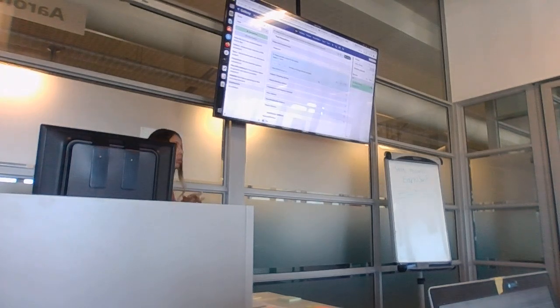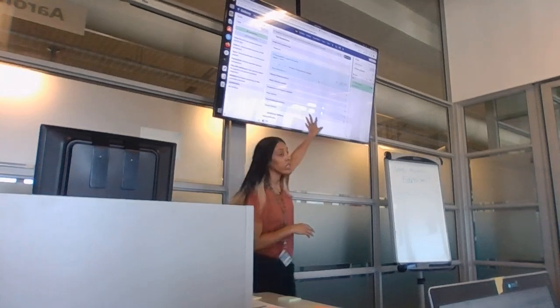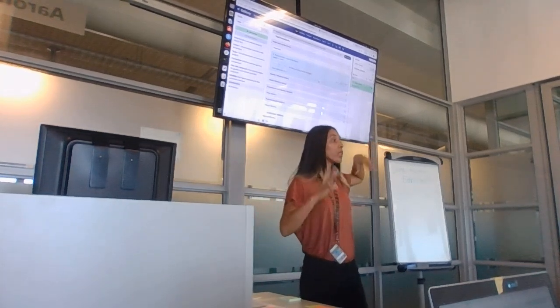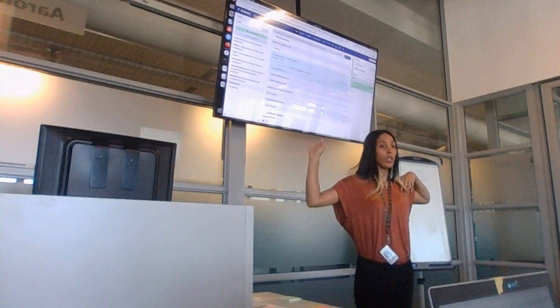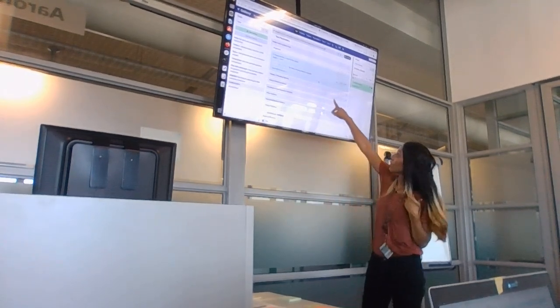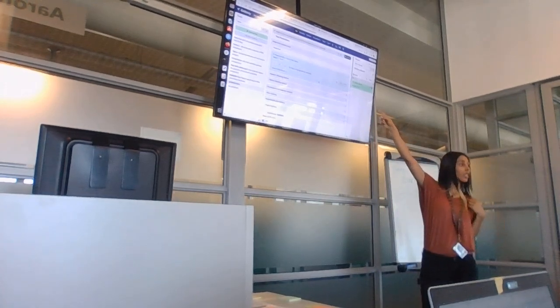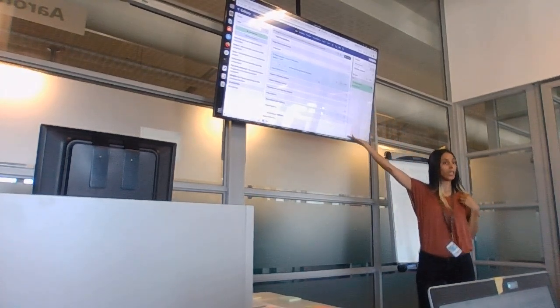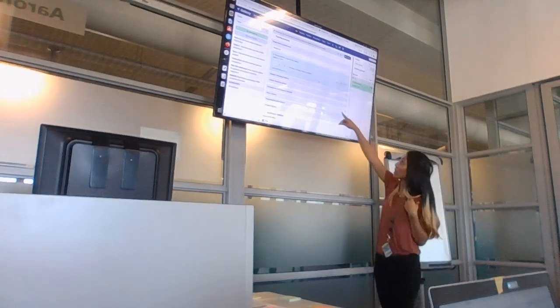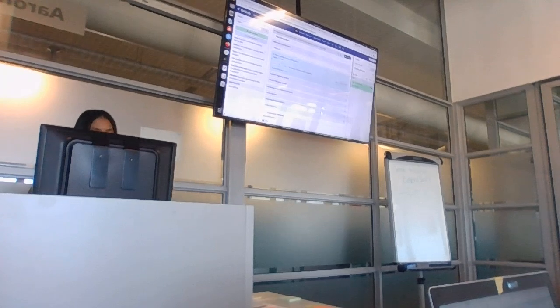But what is the problem here now? Nothing has been selected. Before, when you chose your tool, it just automatically did an input for you. But if you look at the top here, you will see that it says your input is a single-end, and you don't have that, so it didn't know what to add here in the box. Again, I'm so sorry about this.